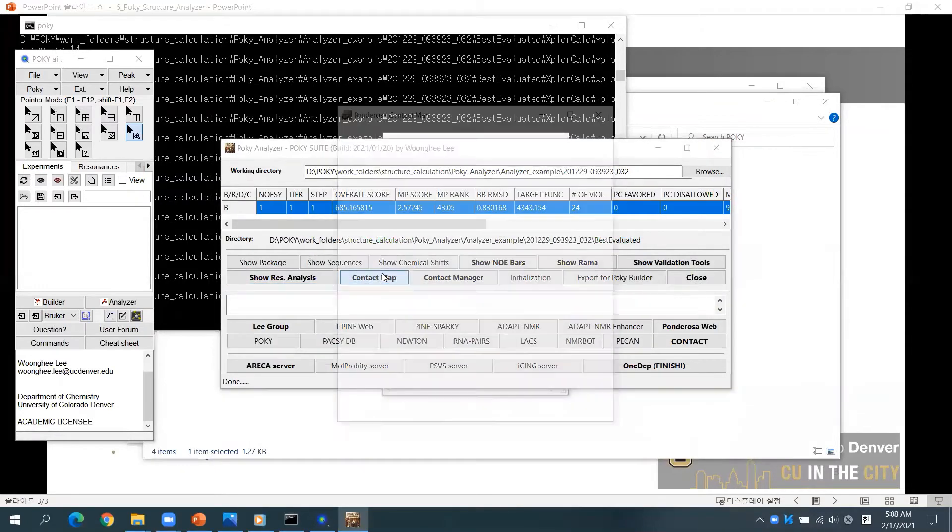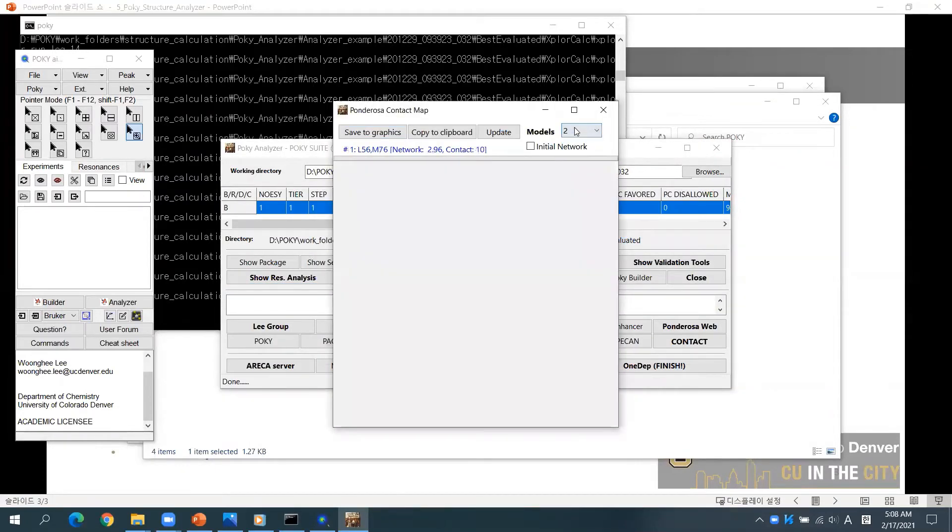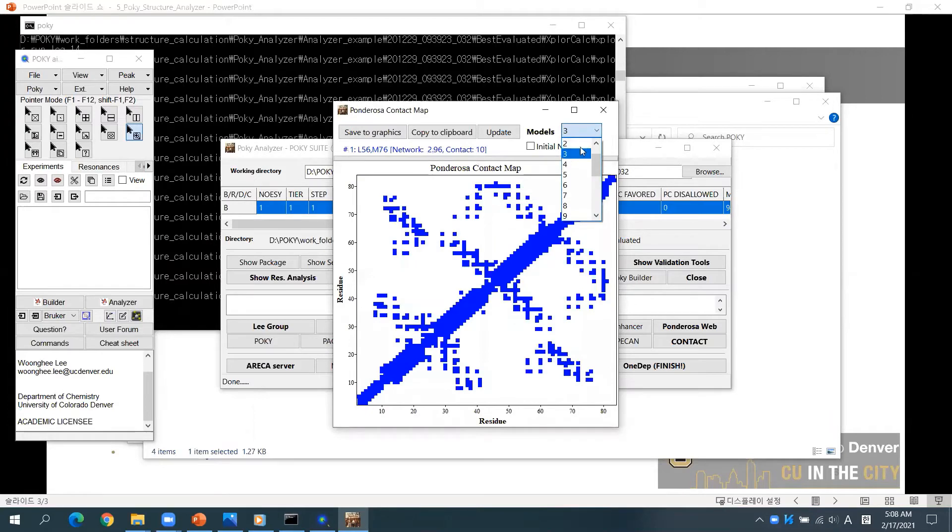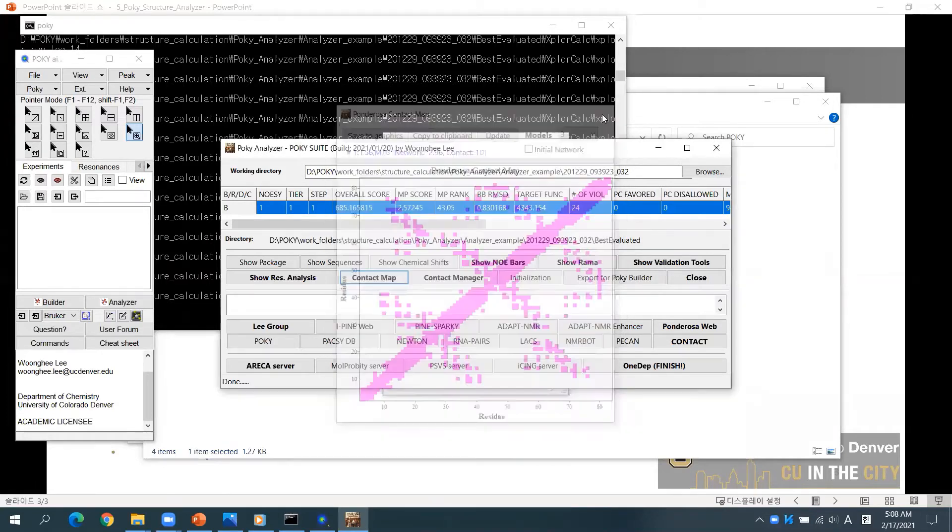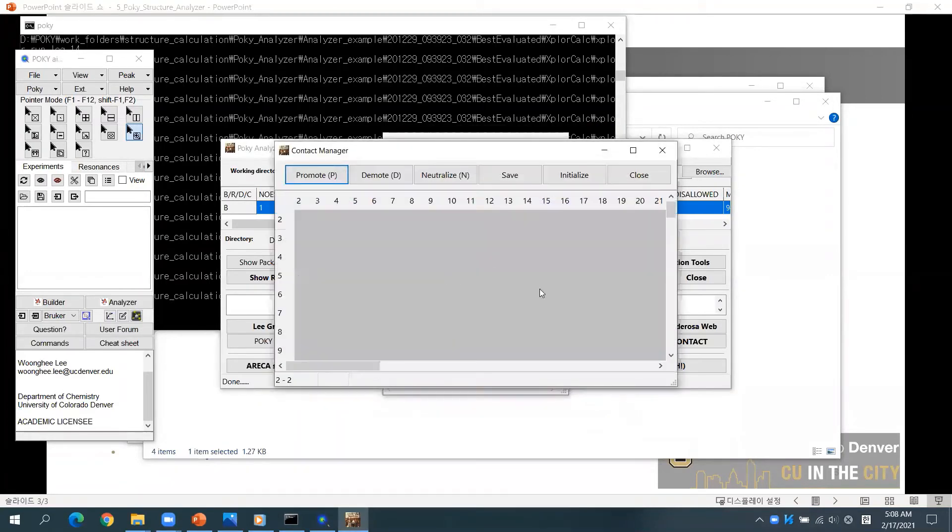If you click Contact Map, you can check contact information. If you want to promote or demote contacts, use Contact Manager.